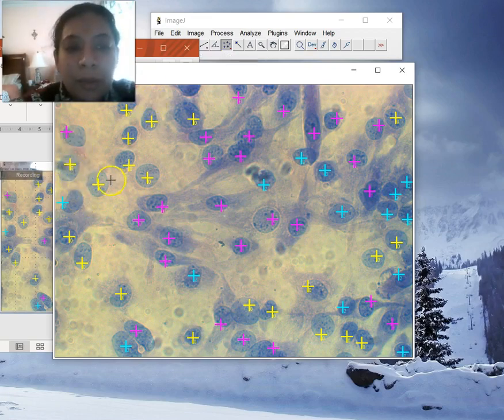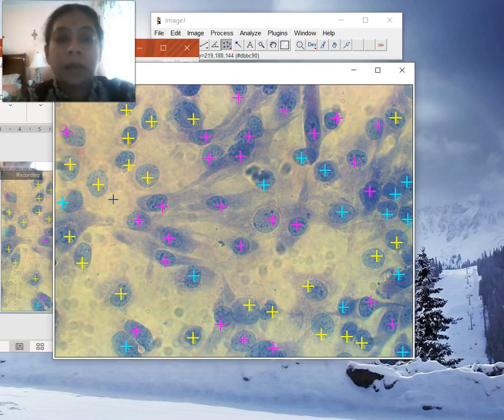To look at some of these unclear cells, we need to first think about what type of differences are present between a cell that is in one category versus the other. This one is a very clear difference. The cells that are undifferentiated are more round or boxy, versus the cells that are differentiating, those are more elongated, so they would be less round.